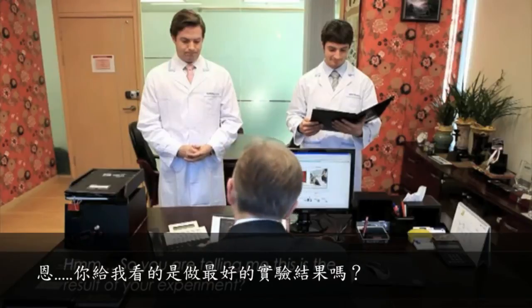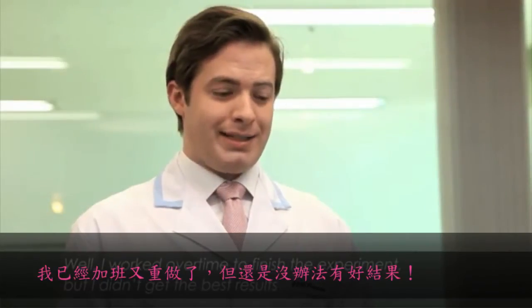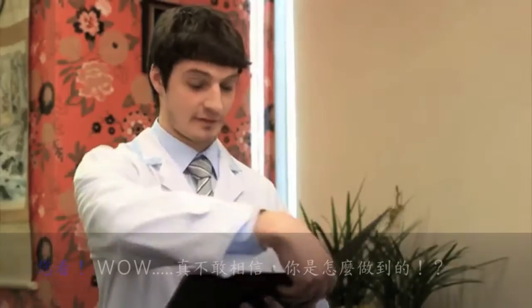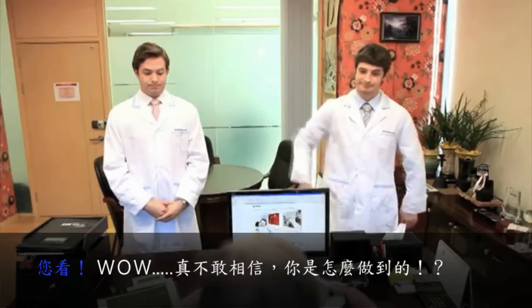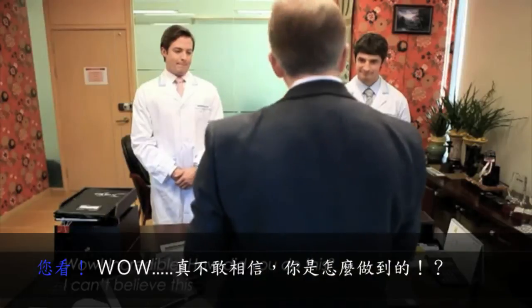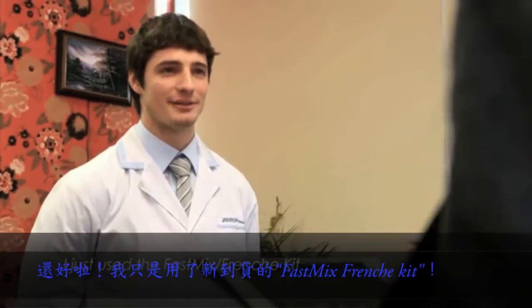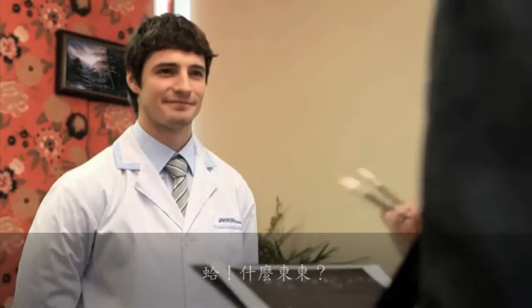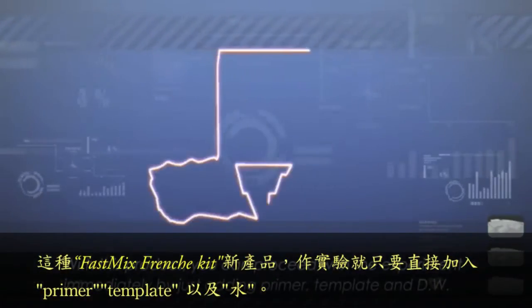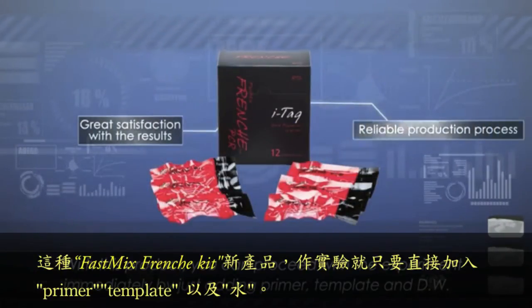So you're telling me this is the result of your experiment? Well, I worked overtime to finish the experiment, but I didn't get the best results. Is that because it was an urgent project? Wow, incredible! How did you do this? I can't believe it. I just used the fast mix French kit. What? The fast mix French kit? With this product you can proceed with the experiment immediately by just adding primer, template, and DW.